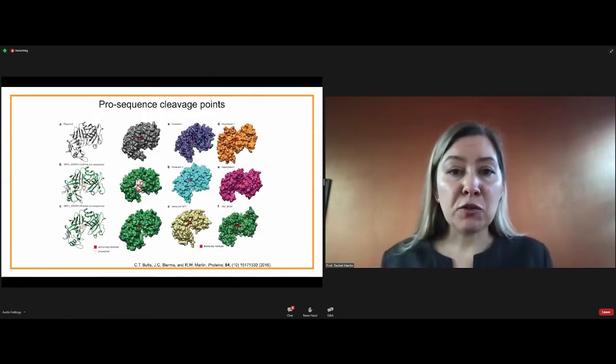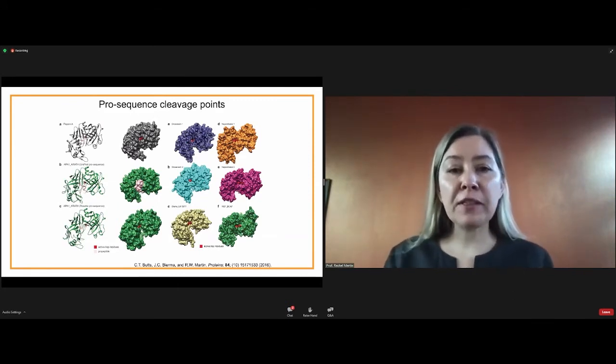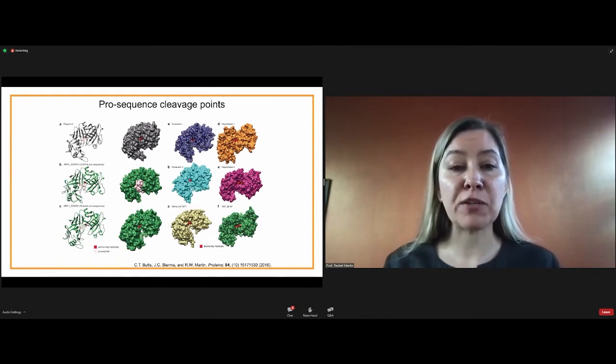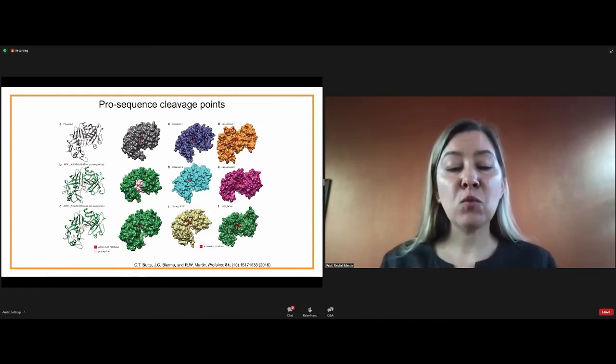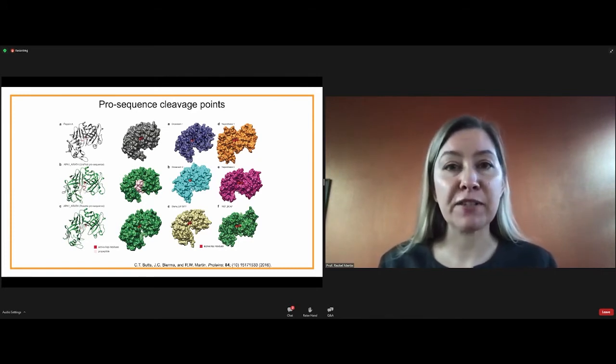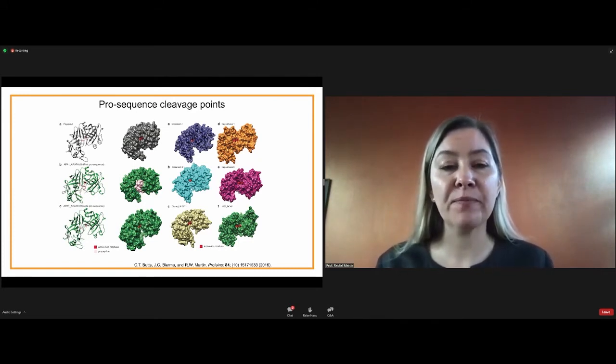All right, so is this useful? What did we learn? So the first thing that we did is predict the structures, and in this case we used Rosetta. And we were able to use the Rosetta structures to actually improve the annotation of this Arabidopsis protein that was in UniProt.